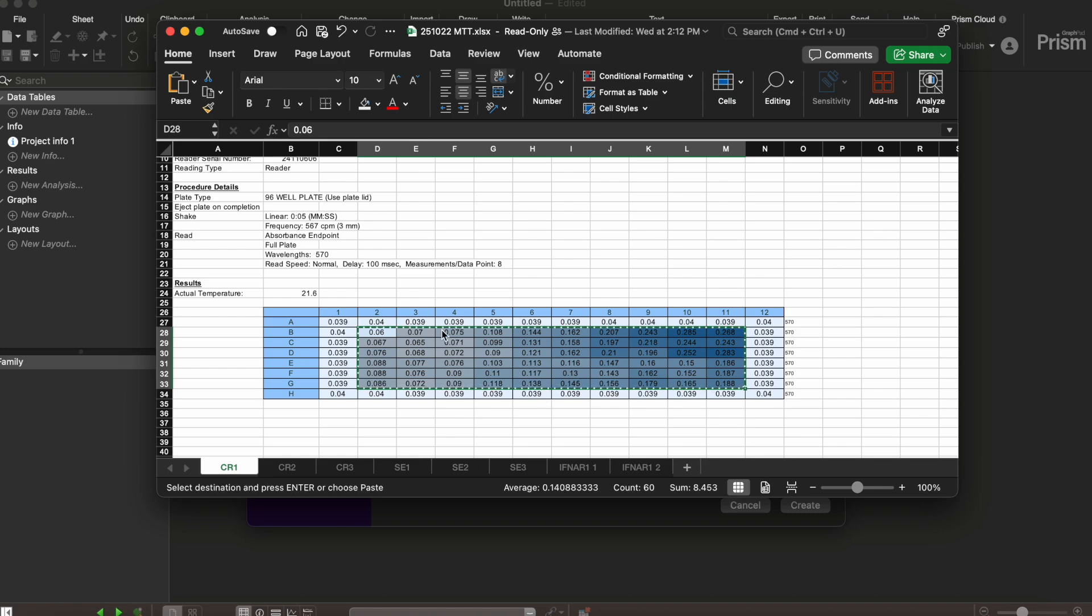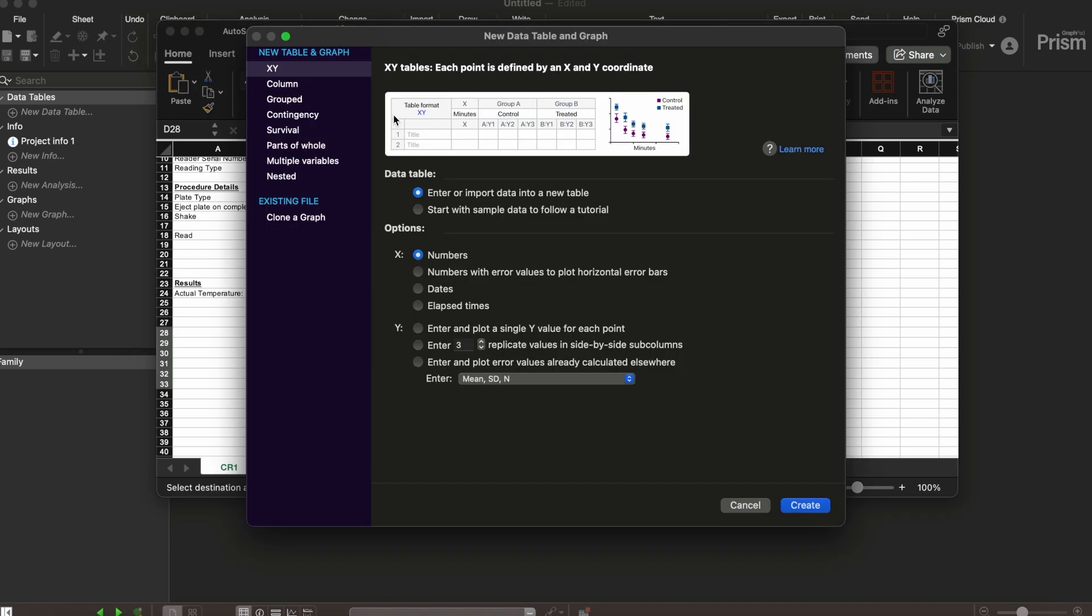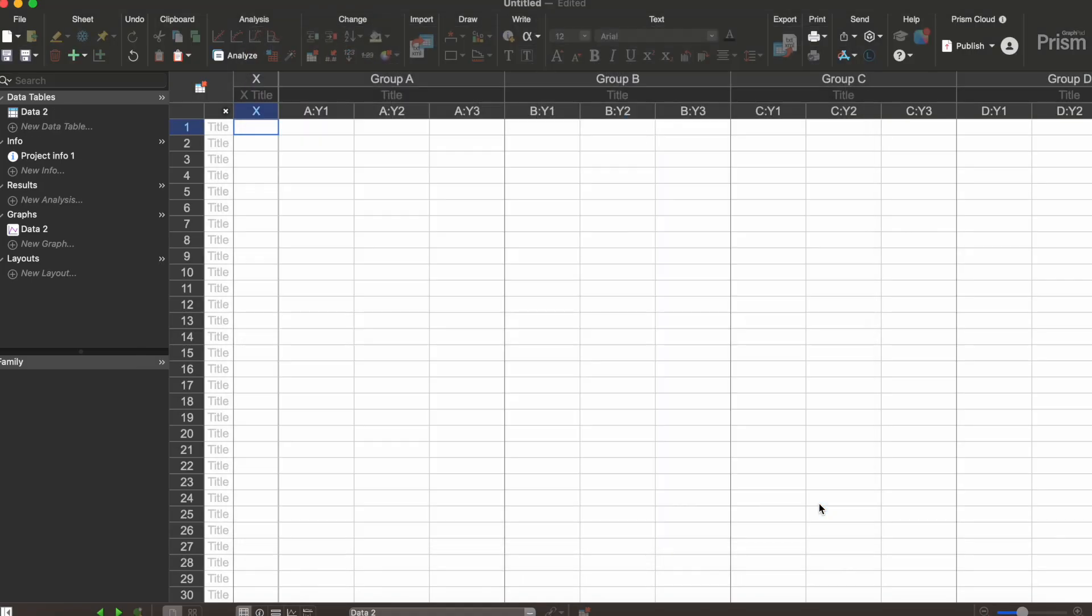So we're just going to copy all of these and mosey on over to GraphPad. We're gonna do an XY graph, import data into a new table, and then for y-axis we're gonna enter three replicate values in side-by-side columns and push create.